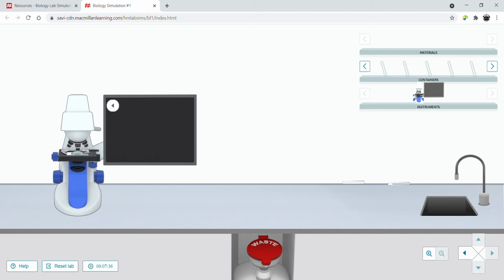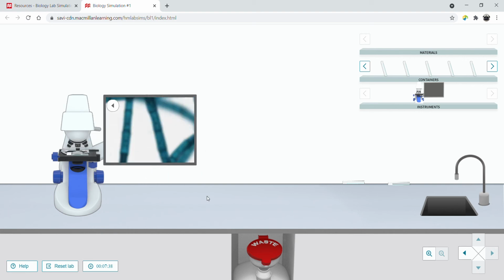All right, here's your Spirogyra. Hey, there it is. There you go. Okay, it's at 100x. And it's like a filamentous algae. Like if you're in a pond and you see what just looks like long strands of green hair in a clump, a big old slimy clump, that's Spirogyra.